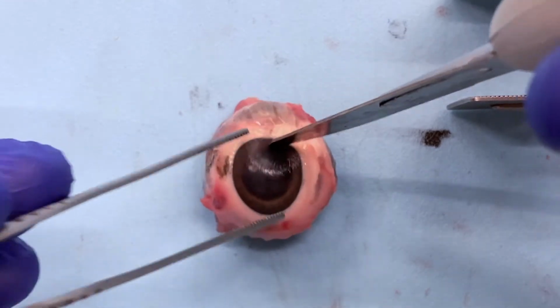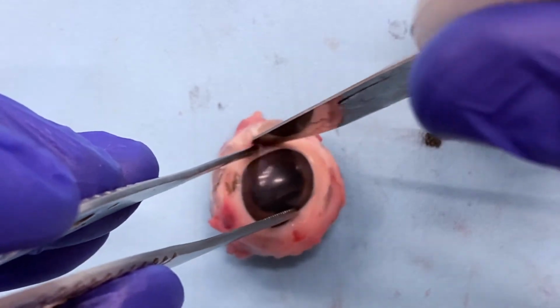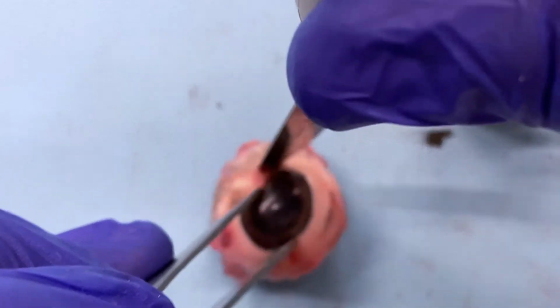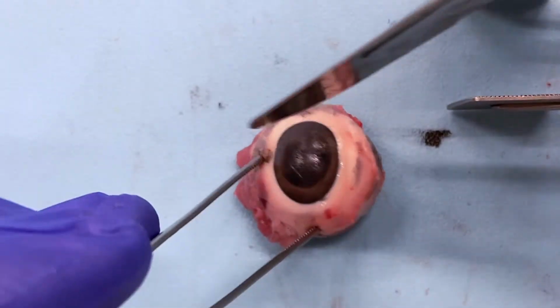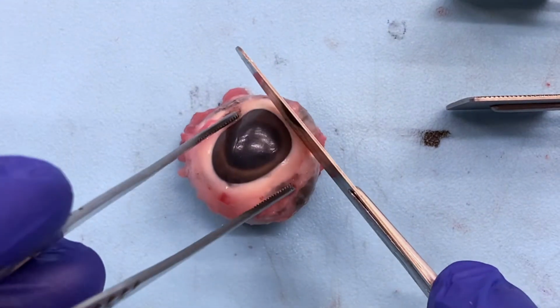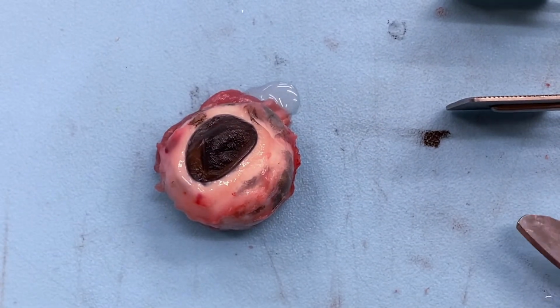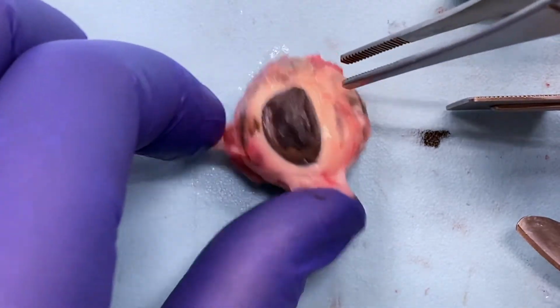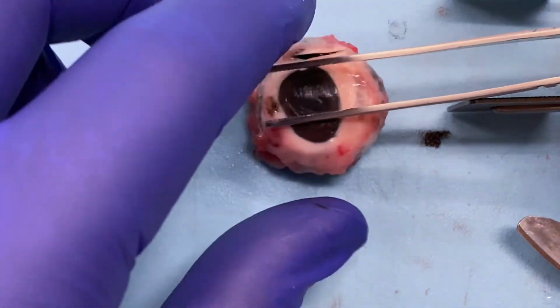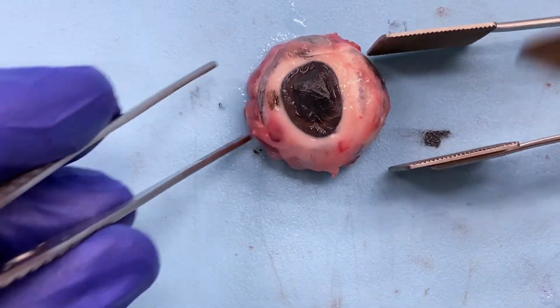Since we're not really worried about the sections on the side here, I'm going to do that over here. Make a cut right here. And obviously be careful. You should be wearing your lab glasses at this point. You don't want to accidentally splash vitreous fluid in your eye. So let's go ahead and make, oh, there we go. See? All right, so now that I've relieved the pressure, this should be a lot easier to work with. In fact, you might want to even flatten it down a little bit. Be careful, because underneath our pupil is going to be our lens, and we'll see that shortly.